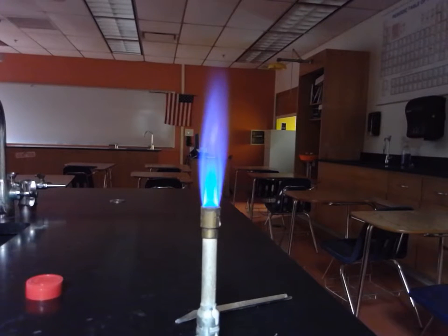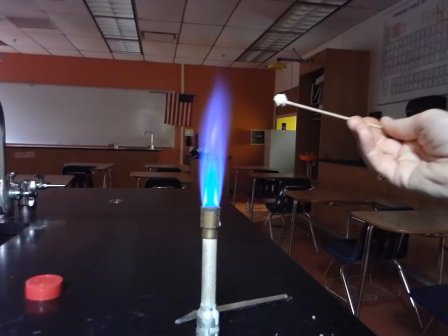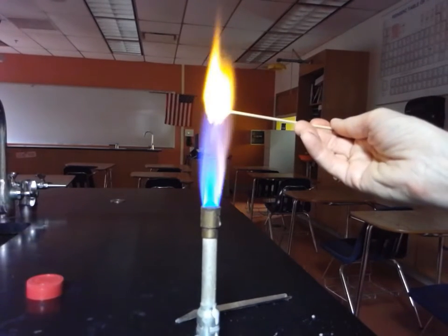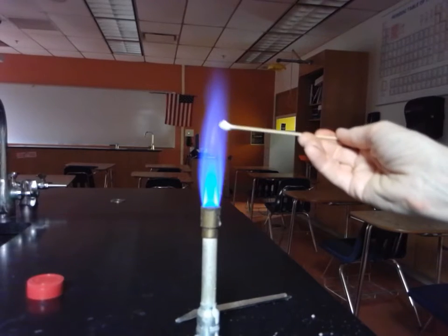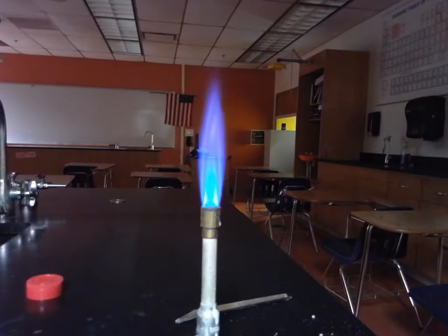All right. The next one, I believe, is strontium, Sr. Strontium. So this one is your strontium. Okay. Strontium. Then we have potassium. Okay. So this one's potassium.